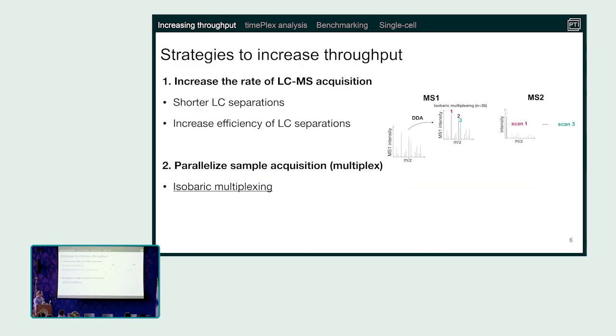Another way is multiplexing samples. These approaches are all complementary. You can do both or one. Today, the talk is going to focus on multiplexing.